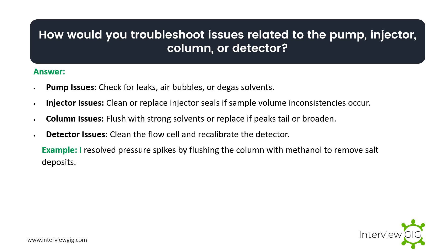How would you troubleshoot issues related to the pump, injector, column, or detector? Pump issues: check for leaks, air bubbles, or degas solvents. Injector issues: clean or replace injector seals if sample volume inconsistencies occur. Column issues: flush with strong solvents or replace if peaks tail or broaden. Detector issues: clean the flow cell and recalibrate the detector. Example: I resolve pressure spikes by flushing the column with methanol to remove salt deposits.